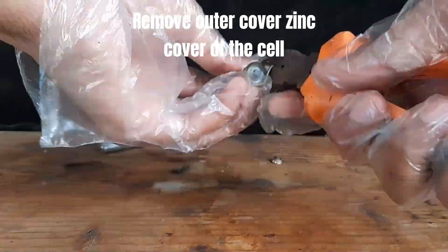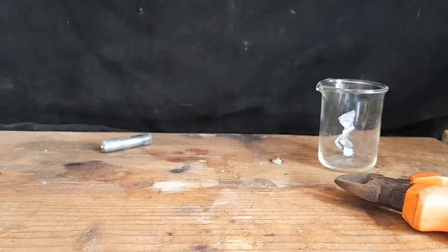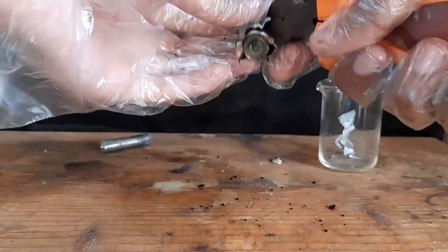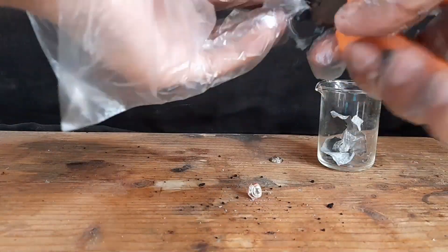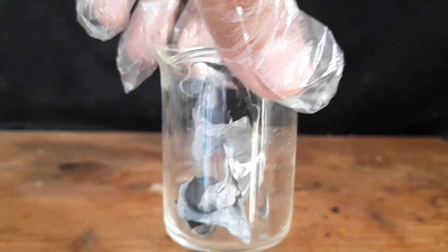Remove the outer case of the cell. I get about 3 grams of zinc metal from two cells.